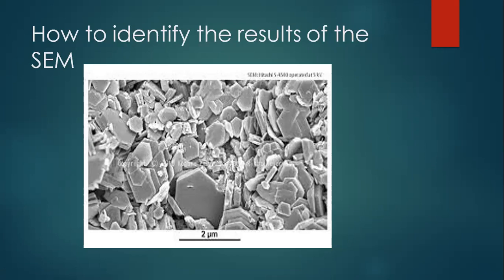And why do we go to the scanning electron microscope? Because we did the XRD before, and we did the XRF. After the XRD and the XRF, we identified the result of this sample as kaolinite. So we take this sample and put it under the microscope, and we know the shape of it is kaolinite, and you can see here how the crystal habits are between them.